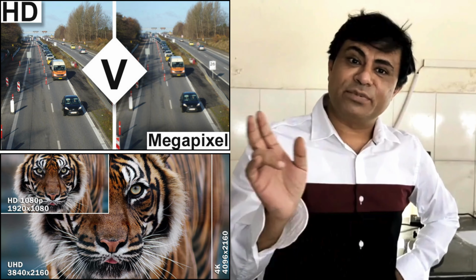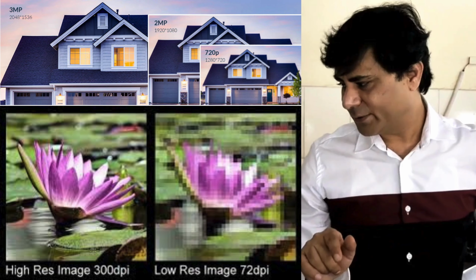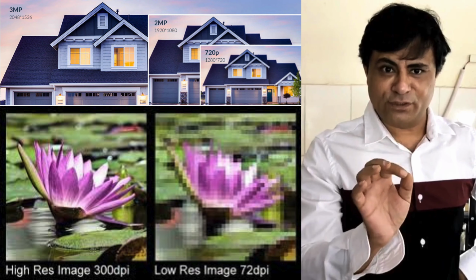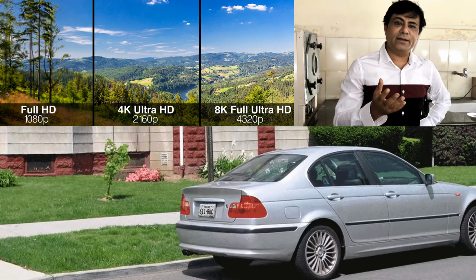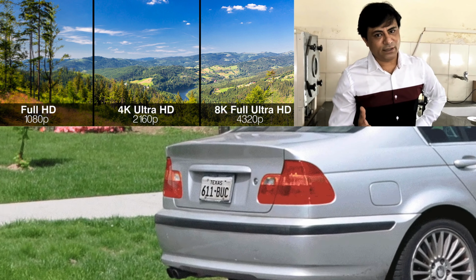That is comparable to the resolving power of a microscope. Resolving power means increase in the density of the image you captured, so that you can easily appreciate the minor details even after zooming.